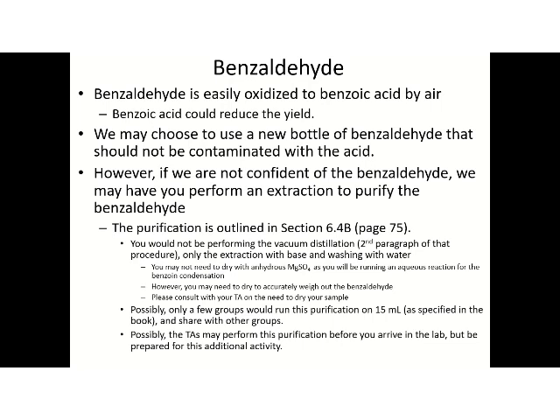What is the purpose of drying the product? Mostly to measure the exact amount of starting material that you used, and then to finally calculate the yield of this reaction. For that you need the initial mass of your starting material and the final mass of your product, pure both, right?